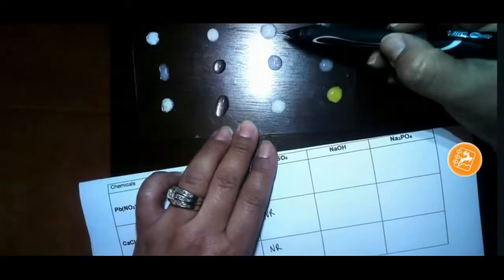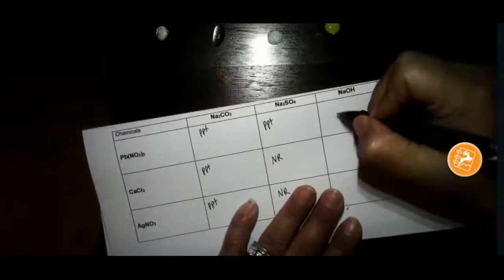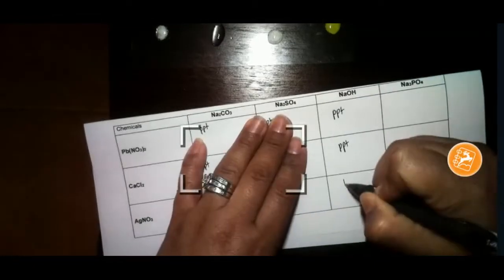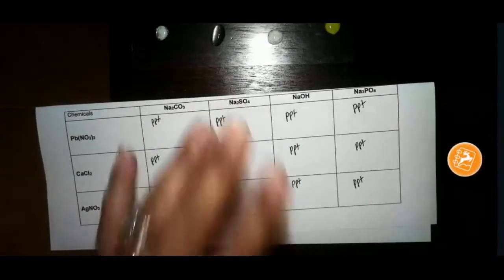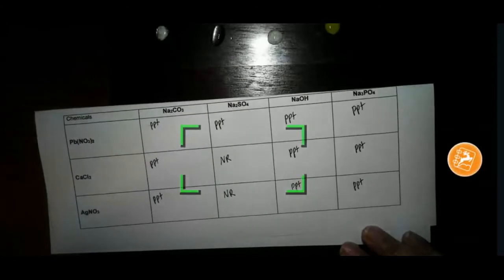Over here, I'm going to record that there are reactions in all these and all these. So PPT, PPT, PPT, PPT, PPT, PPT.